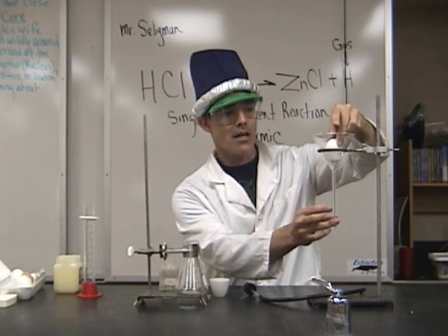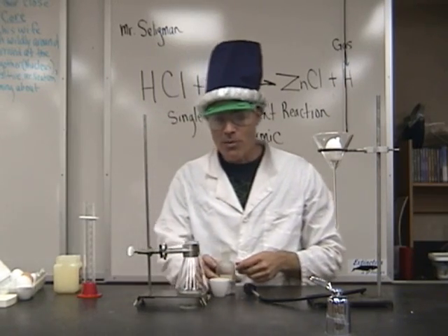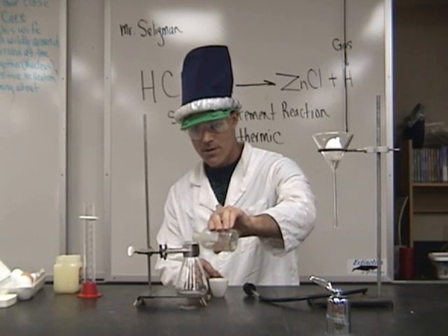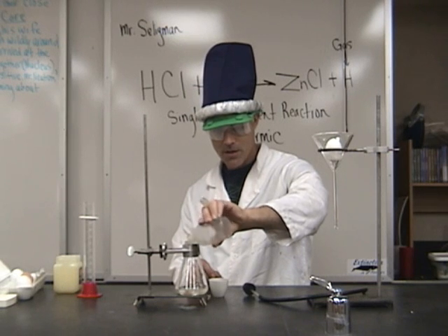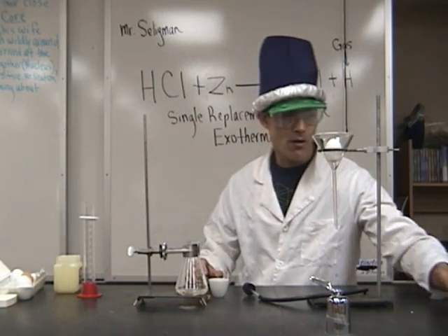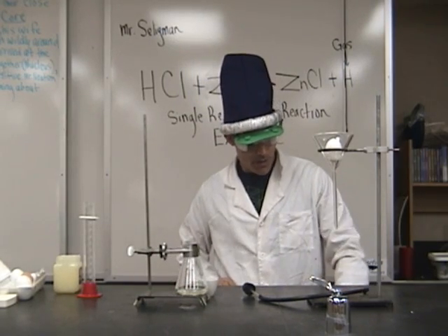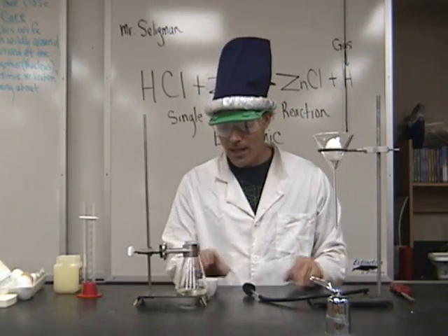Then I place the egg inside of the glass funnel — there's a nice tight seal between the sides of the funnel and the egg. Next, I take my reagent bottle. Notice how I turn my hand over, grab the stopper, and keep my mouth and nose away from the contents. I pour some hydrochloric acid — otherwise known as muriatic acid — inside of the Erlenmeyer flask, approximately 50 milliliters. I cover it up, remove the reagent bottle, and then pour the zinc inside the Erlenmeyer flask. I make sure I have my barbecue lighter ready, which is actually very important.